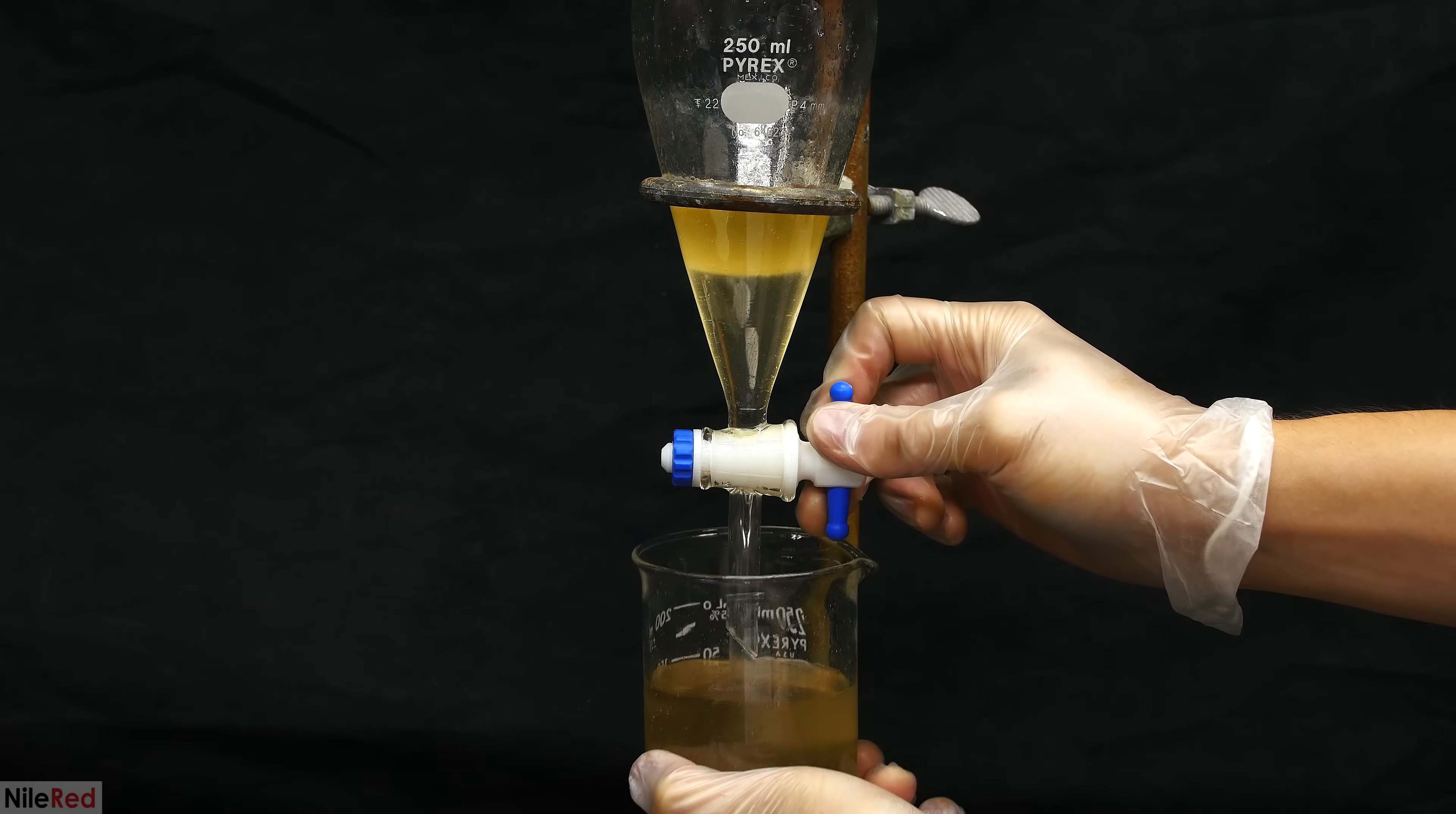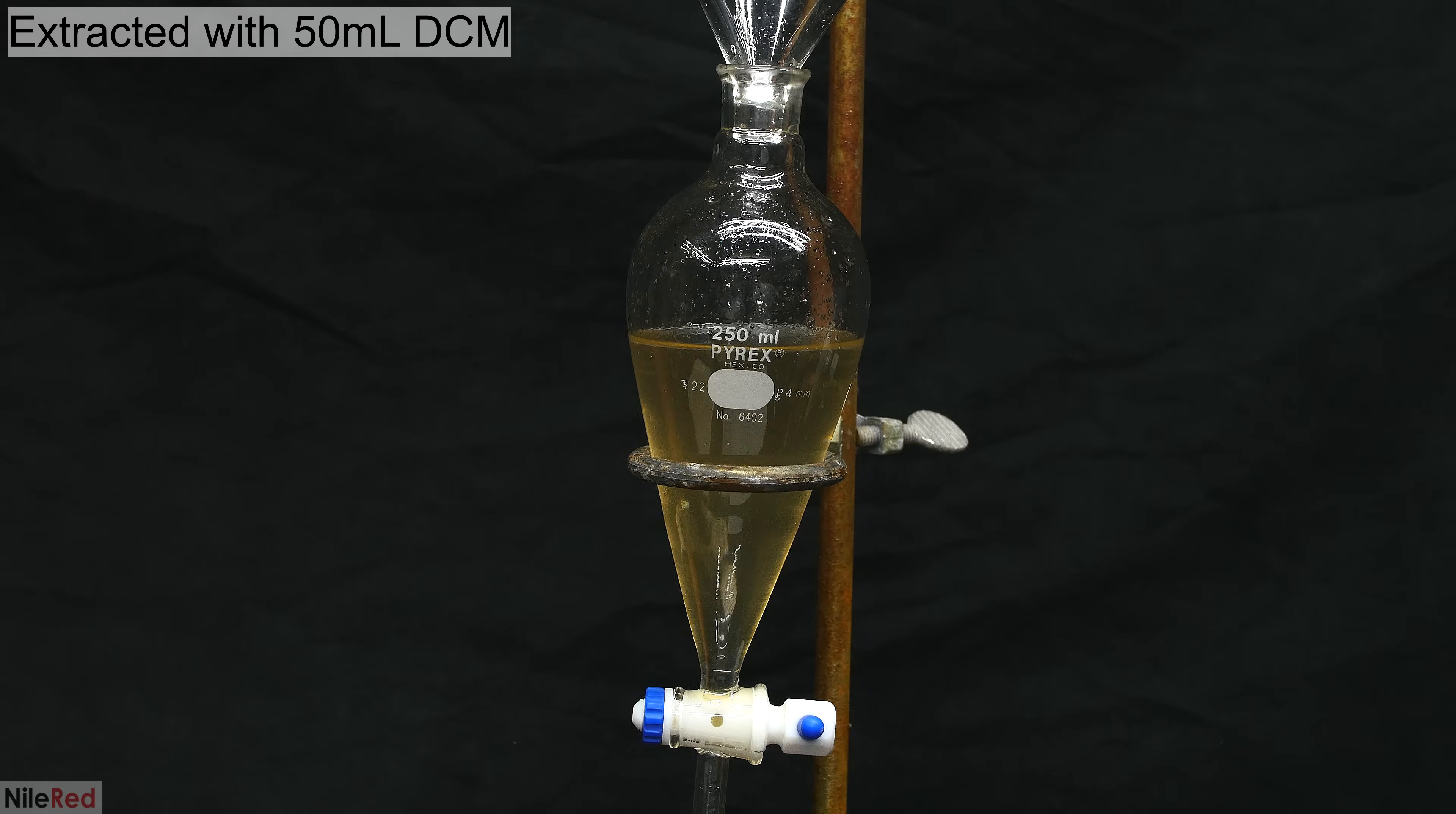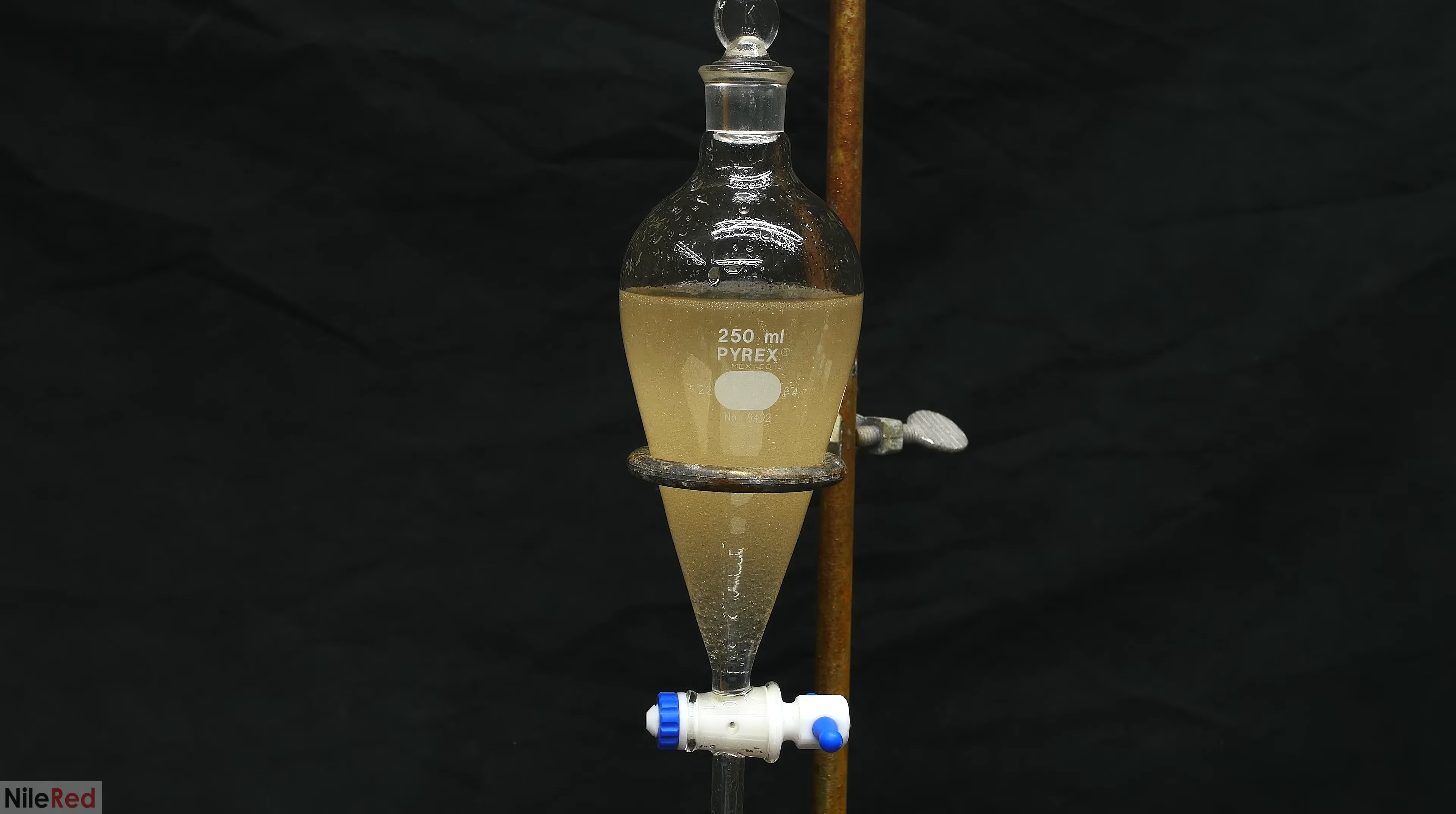The lower aqueous layer is drained into a beaker and it's momentarily placed on the side. The upper layer, which should be almost entirely anisole, is poured into another beaker. The separatory funnel is placed back on the stand, and I pour the aqueous layer back in. I then add 50 milliliters of dichloromethane. Anisole is practically insoluble in water, but some of it either still dissolves or just floats around in suspension. Anisole is soluble in DCM, so with this washing step, we're able to pull any anisole that might have been left behind.